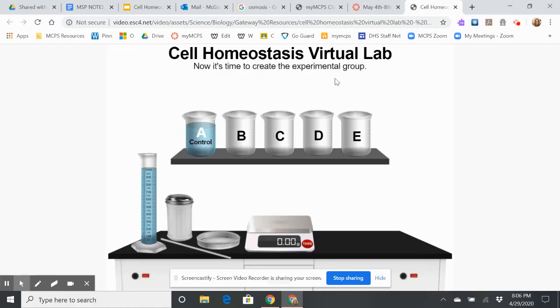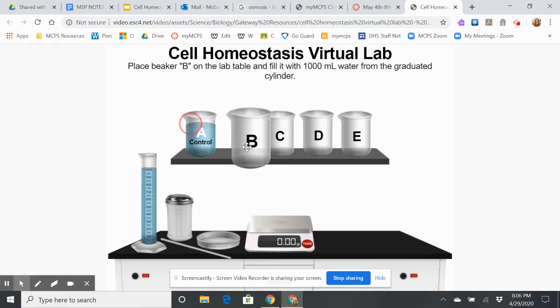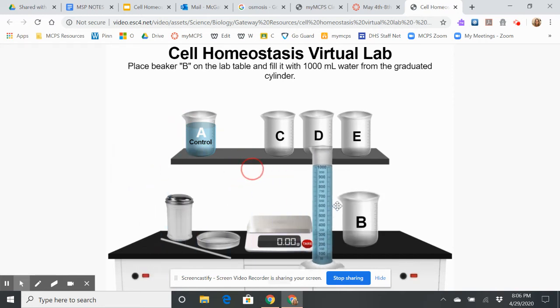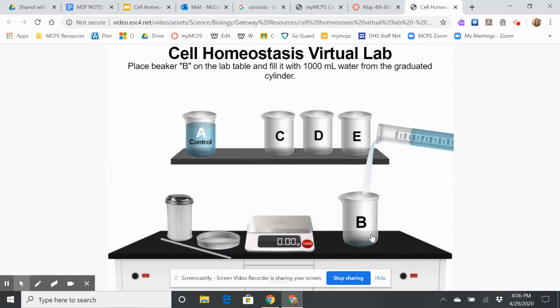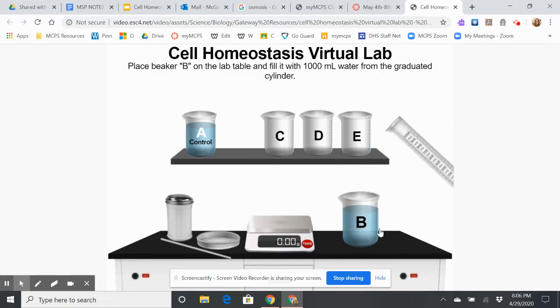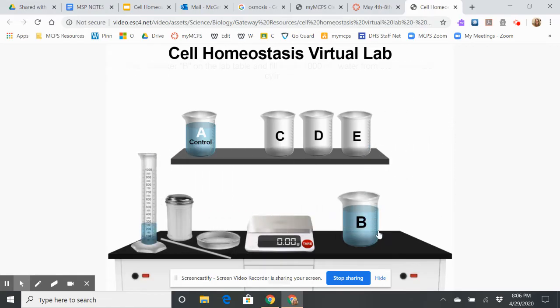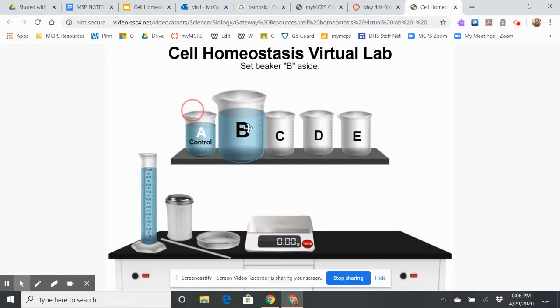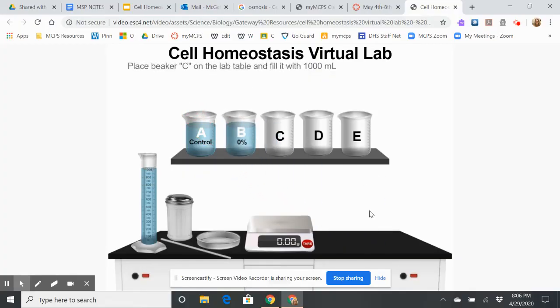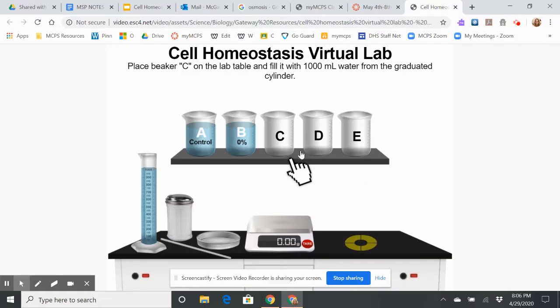Now it's time to create the experimental groups. Beakers B, C, D, and E will be experimental groups. I'm going to put beaker B over here, and I'm going to put the same amount of water in it, because that would be a constant. Beaker B is going to have a 0% solution, meaning it has no sugar in it — it's just 100% water.